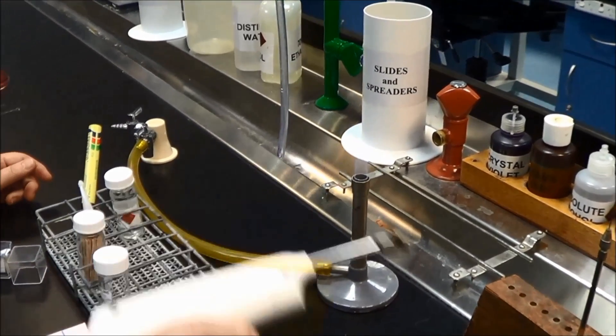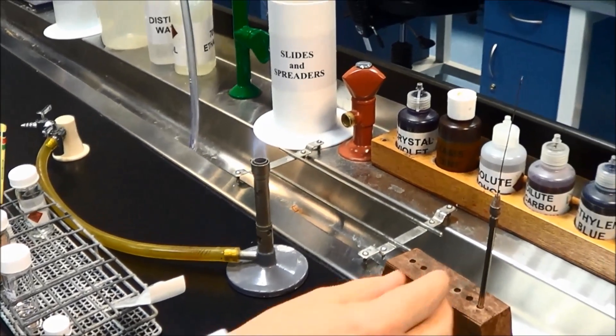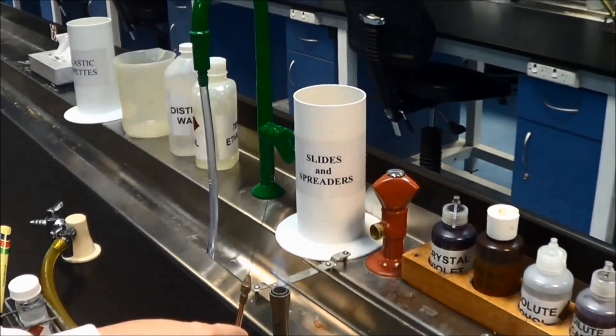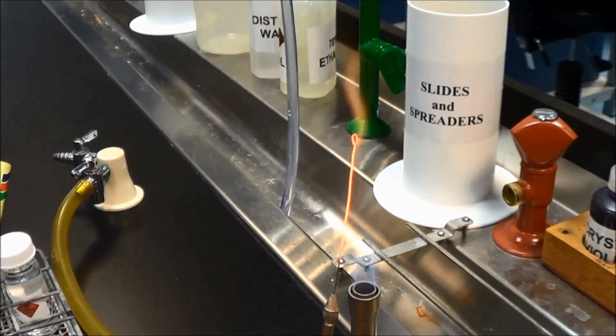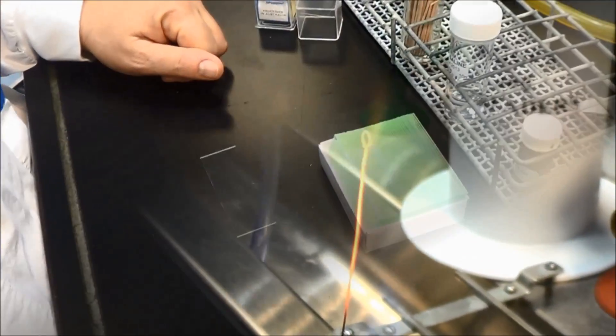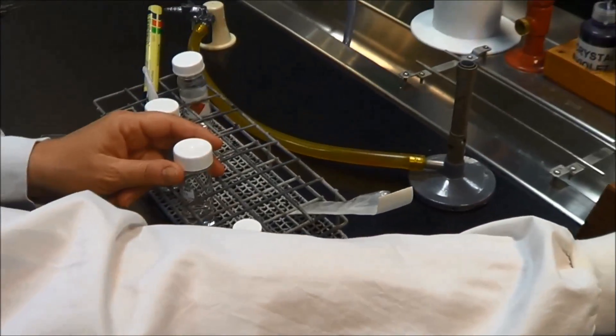Capsule staining to prepare an India ink wet mount for microscopic examination of Cryptococcus. Pre-flame a loop to ensure it is sterile. Using the sterile loop, place a loopful of saline onto a microscope slide.